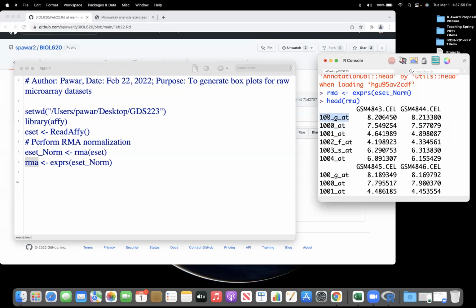Okay, so now you can see that these are unique. Can you define the gene names from these IDs? What is this gene? Because genes have a unique gene symbol, right? It can be like HER2 or BRCA2, so it has a unique gene symbol, ID or name. Is this a unique gene symbol? Can you know what gene this is with these IDs? Just by looking at these IDs, can you say which gene this is?